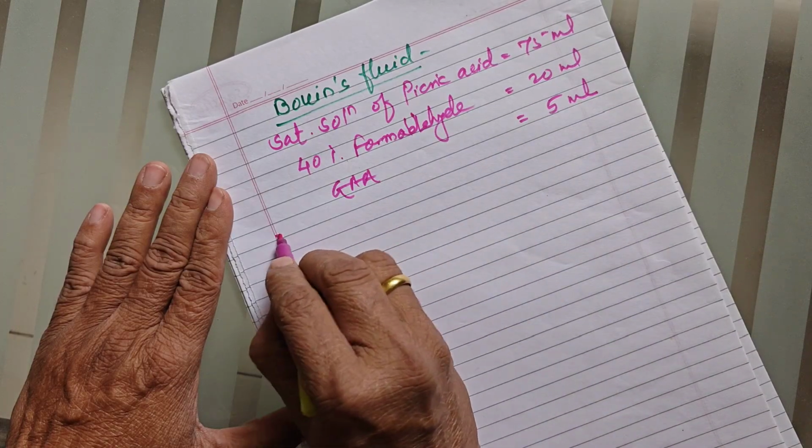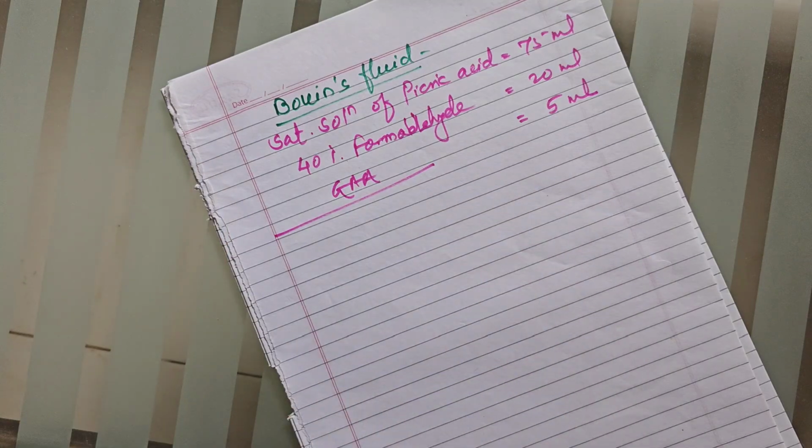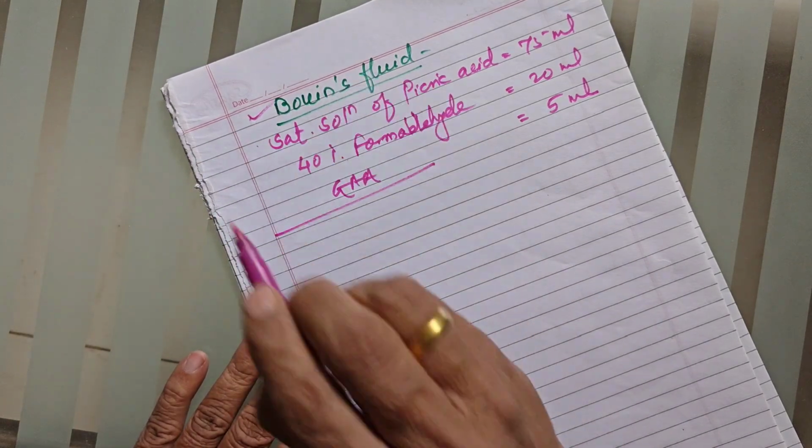So this solution is called Bouin's fluid.